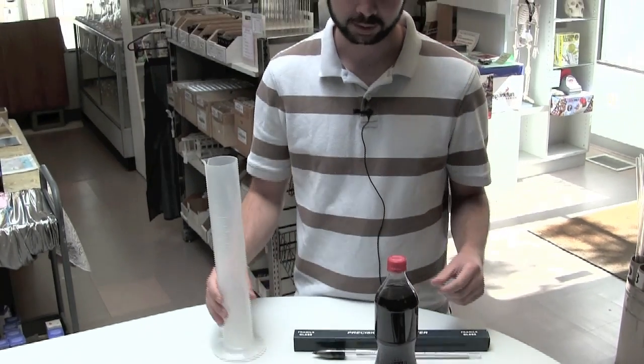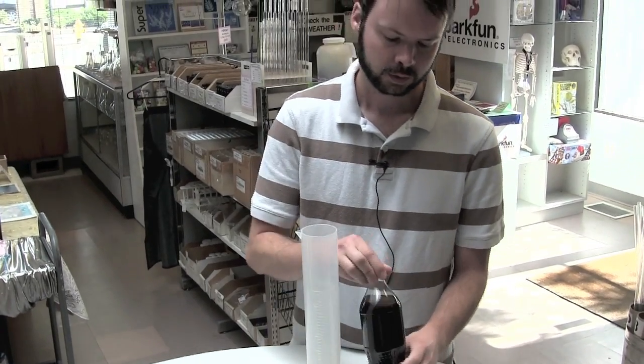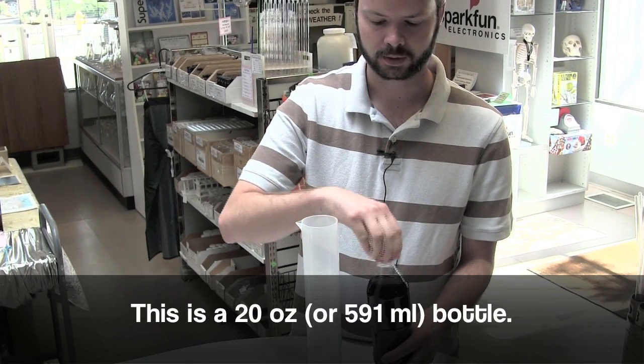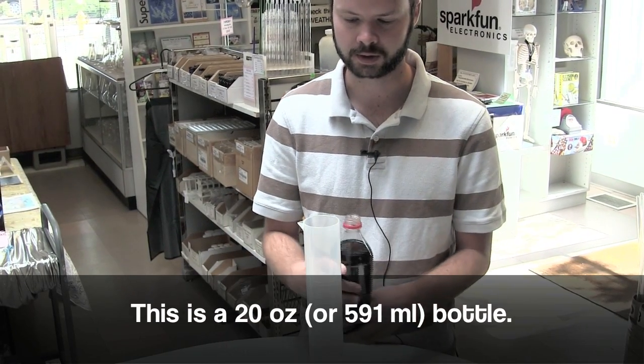So after you've got all your supplies together, take note of the volume of your beverage in milliliters and pour it into the graduated cylinder carefully.